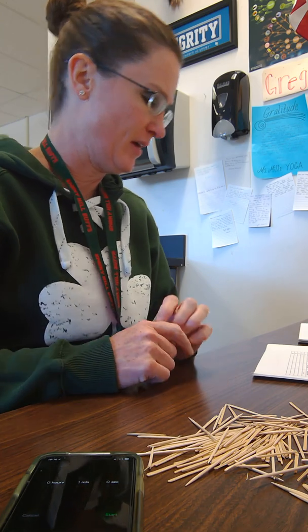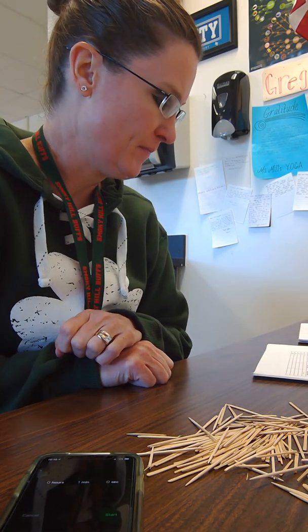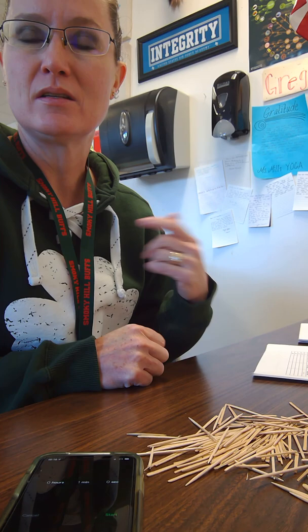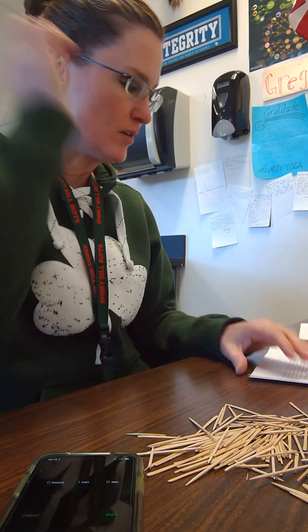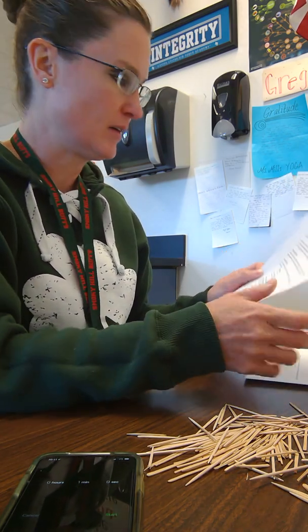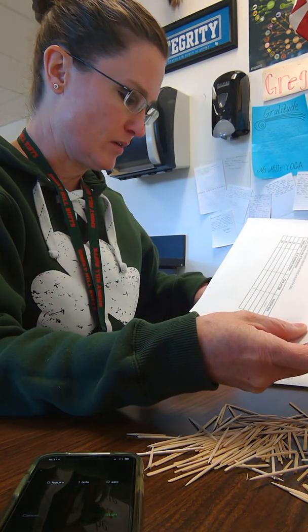And so now we have our numbers on there. So make sure you have your data table figured out. And then it is how many over seconds. And so it was 10 seconds or 20 seconds or 30 seconds or 60 seconds or whatever it was. So you got to do a little bit of math there. And so if you struggle, there's a little formula on there for you to do. And then you need to answer the questions that go along with that.